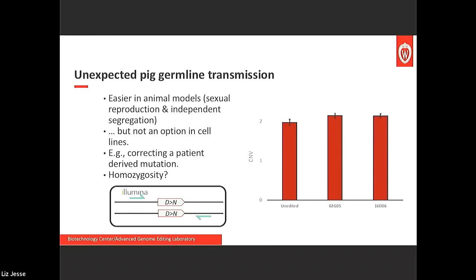Maybe you're right or wrong about whether it's a true het or a compound het, and you just have to weigh, if I'm wrong and it's not the sequence, how does it affect the interpretability of my results? We don't always have to spend all of the money in the world looking at it. You just need to be aware that these are the kinds of things that can happen, and then ask yourself, is it worth going to that next step to validate it?